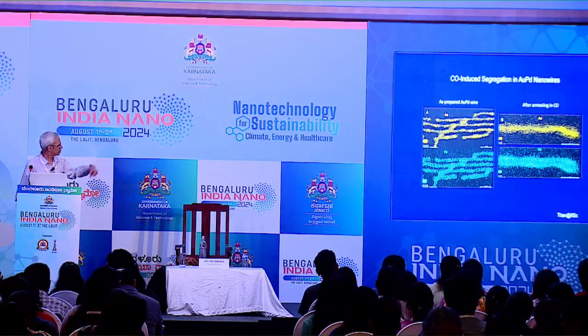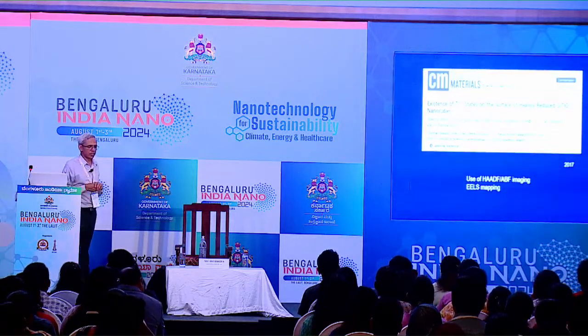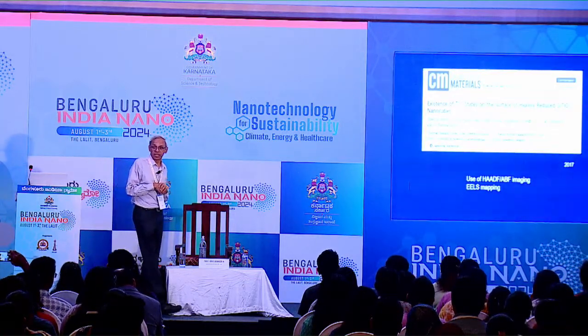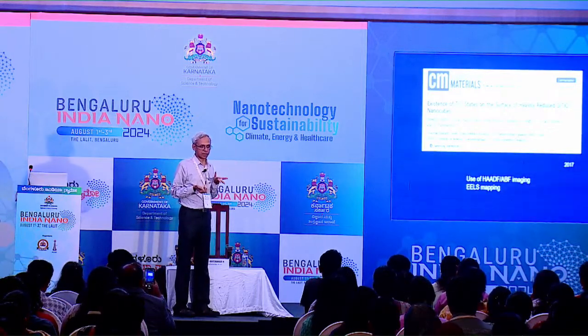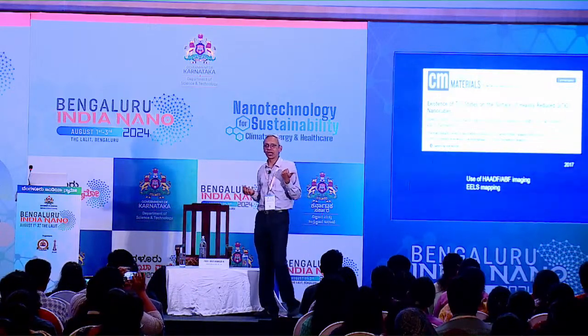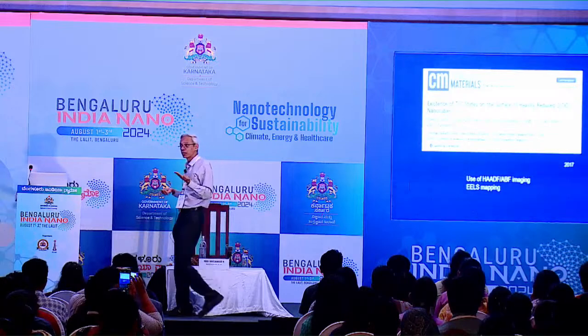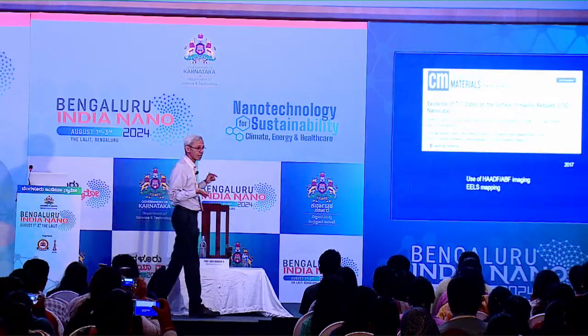Fine, so we can actually do the atomic mapping. The next example that I want to give you is about spectroscopy, electron energy loss spectroscopy. So far I showed you imaging, structure and composition. Now I will show you what you can do in terms of oxidation states. I told you electron energy loss spectroscopy is very similar to XPS, where you can get oxidation states and things like that, right?